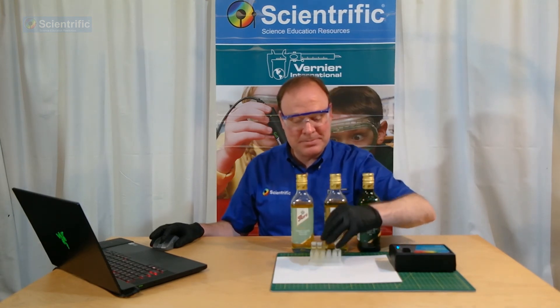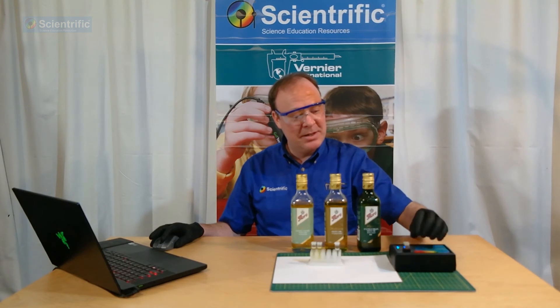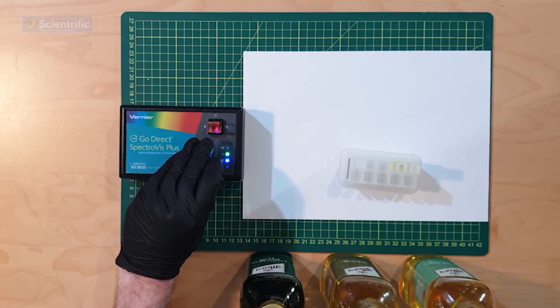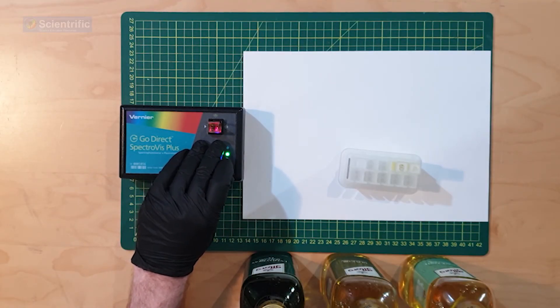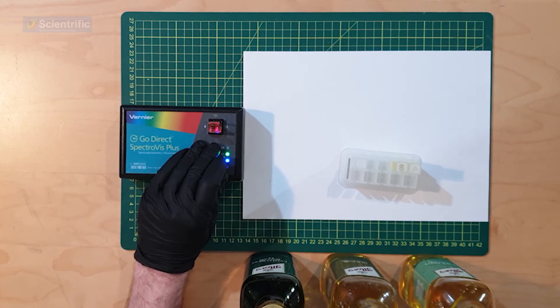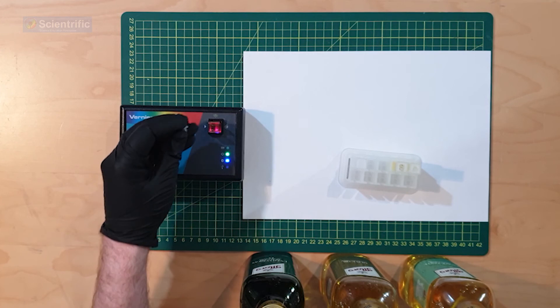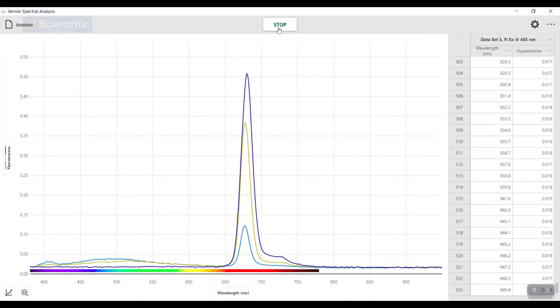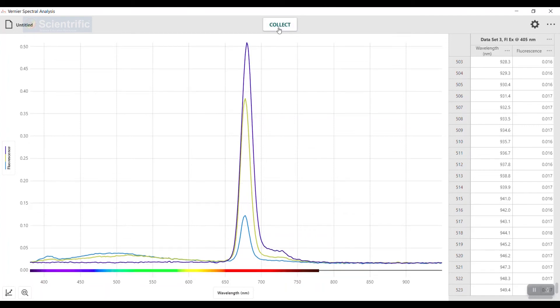Now for our last one, the extra virgin olive oil. Pop that in there, and if you look carefully—I'll carefully take the lid off—you'll actually see that unlike the other ones, which had a slight blue tinge, this one has a red tinge. The wavelength has gone through the blue part of the spectrum, excited the molecules, and now it's fluorescing at red. Very noticeable with this one. We'll pop that back on and hit collect. You get that wonderful peak there. I'll hit stop.